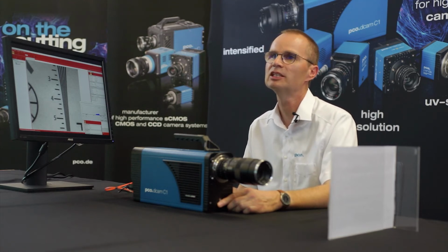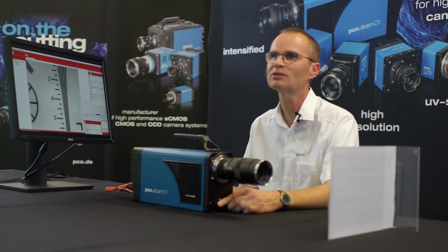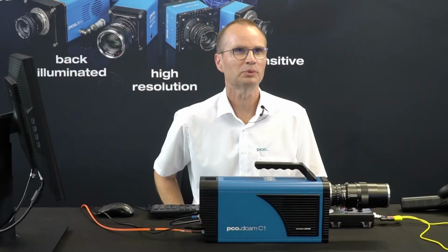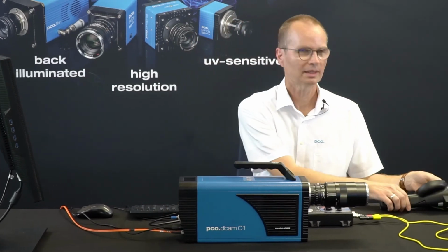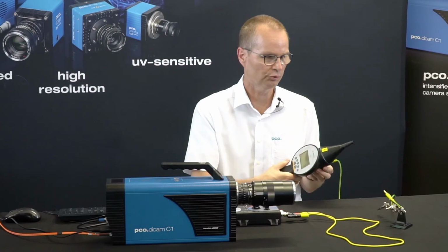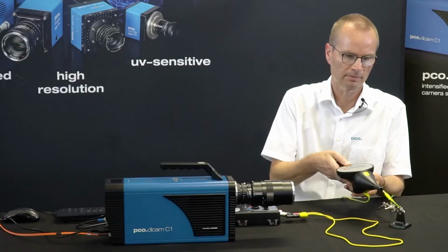As said in the intro, we need this camera when ultra-short and precise exposure times of a few nanoseconds are requested, what we call gating. To give you an impression of what it could look like, I have prepared a simple experiment. This is an EM testing device, which can produce small discharge sparks driven by 15 kilovolts.